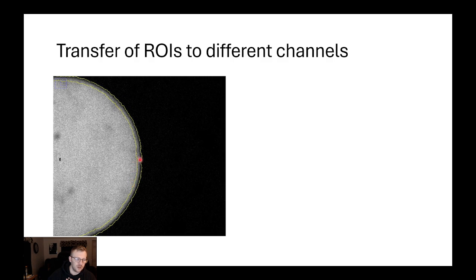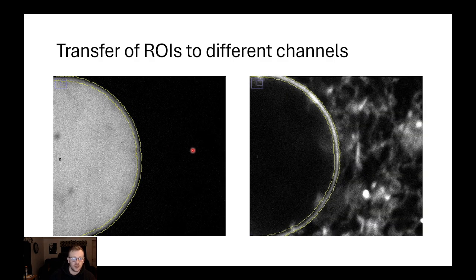And then the really cool thing about this is I have generated these regions of interest around this rim of the nucleus here. If I'm interested in the nuclear envelope, for example, I can transfer the ROI I generated based on the NLS localization inside the nucleus to another channel. And now I have an ROI that is specific to the nuclear envelope around the nucleus, and to measure the intensity of the nuclear envelope proteins, I can subtract this inner halo from this outer halo, and I'm left with the difference, which is what's in between them.